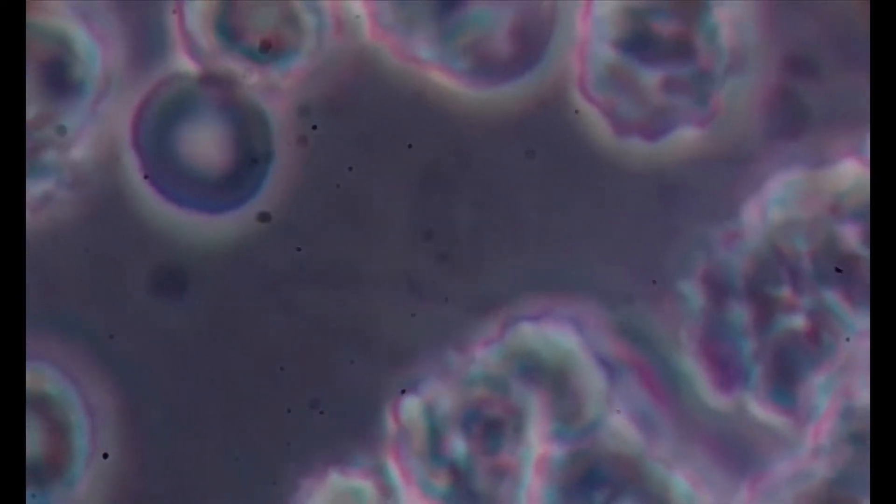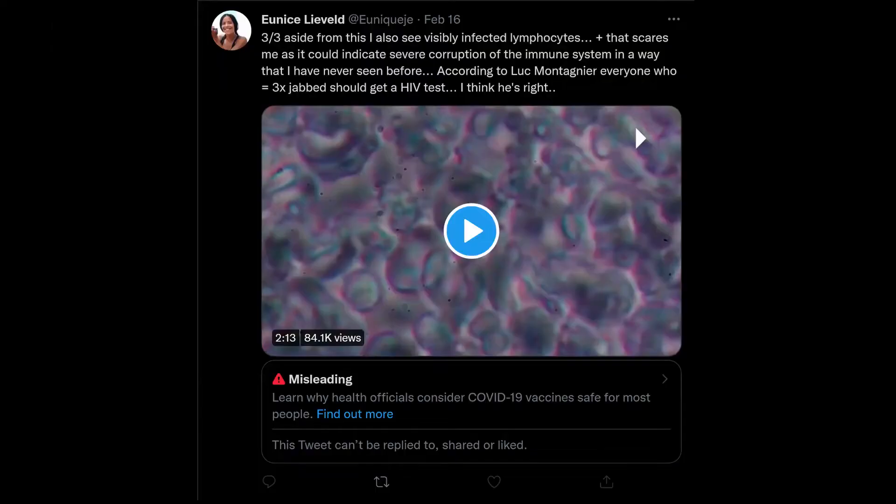Because this is what her blood looks like. And if you're really honest, you don't need to have a PhD to see that this doesn't look normal at all. Look at all the bacteria in here, all these lines - these are all fibrins that make blood clots. This is the same sample, and here you can really see the damage that it's doing.